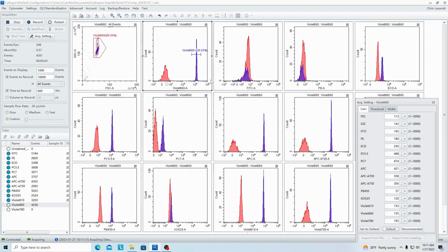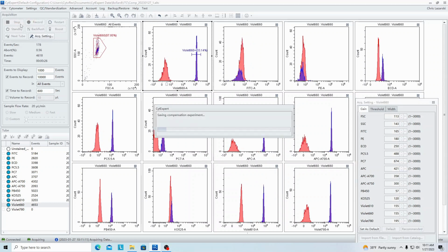This will be a close compensation, but I always recommend to be more conservative in changing, because gains can tend to just creep up and get very high. And it's better to try it out at the original gains and then see if they work.